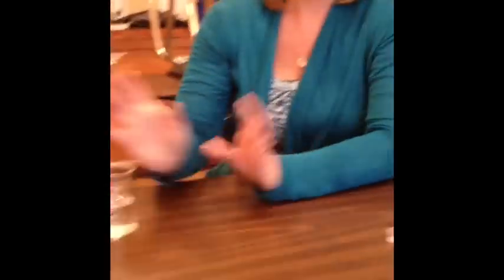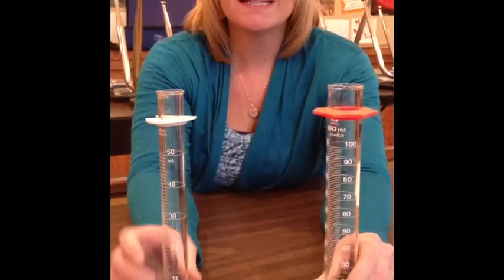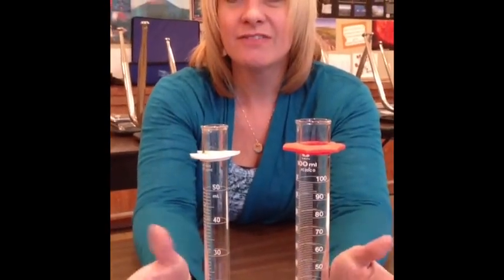The tool to measure volume of a liquid accurately is called a graduated cylinder. These are graduated cylinders. This is a graduated cylinder. This is a graduated cylinder. They just look different.